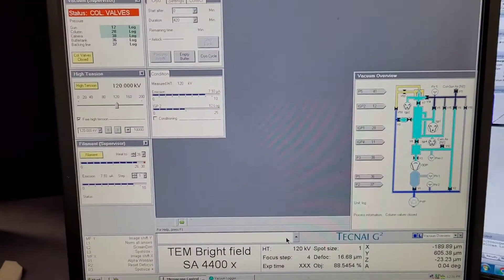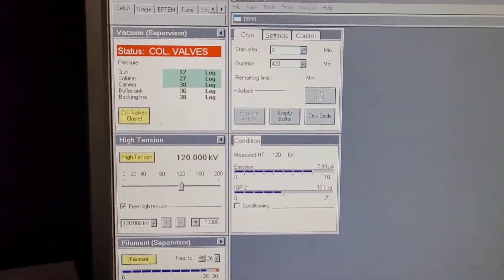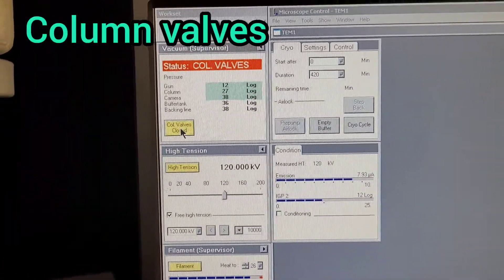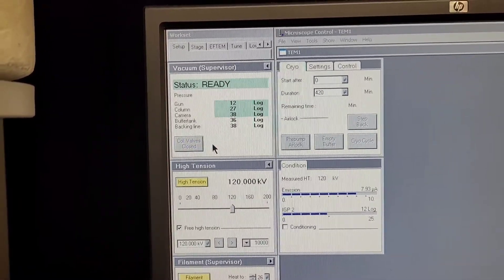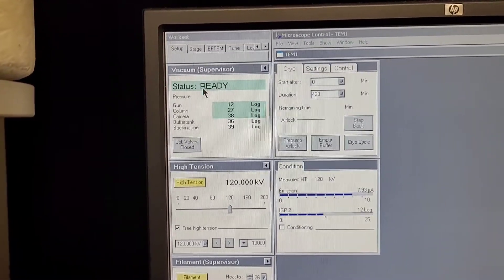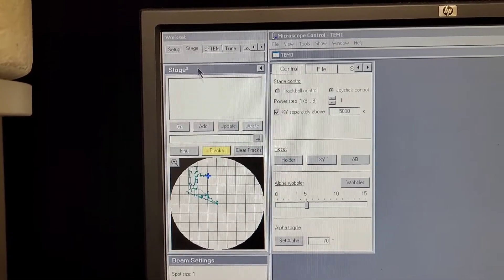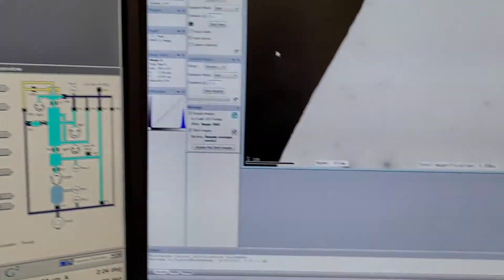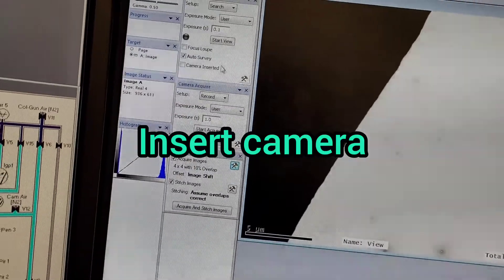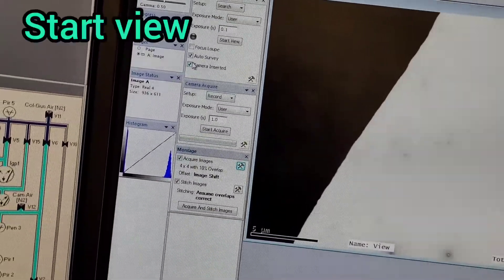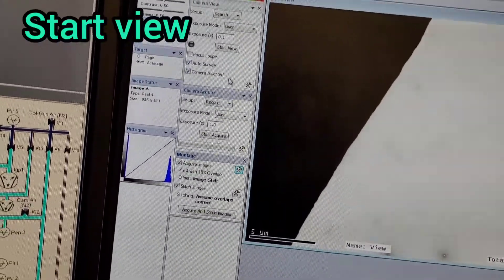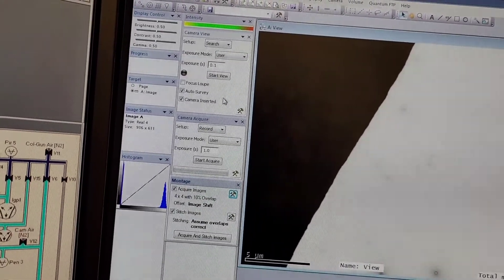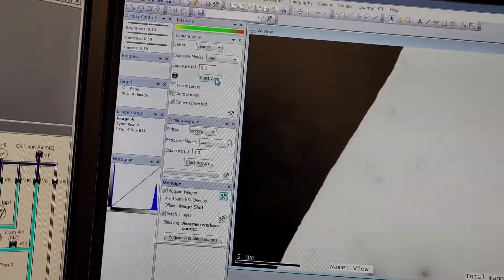Finally, you select the valves to develop button to isolate your sample. When you see ready, it means that it's ready. The next thing you have to do is insert the camera and make sure you hear the sound that it inserts.